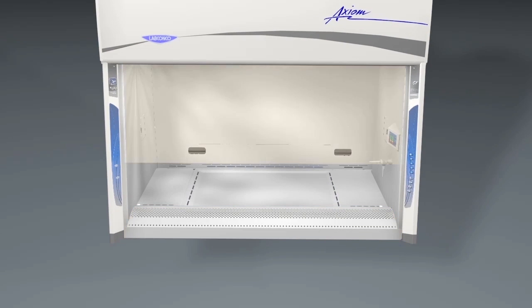The air inlet grill, safety glass sash, and work surface of the Type C1 have similarities to other Class II biosafety cabinets.